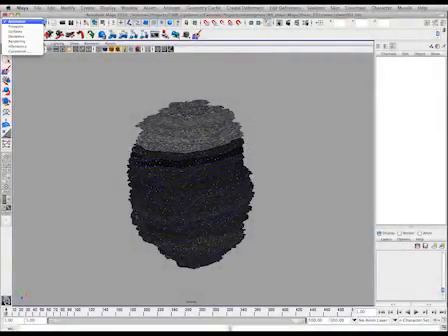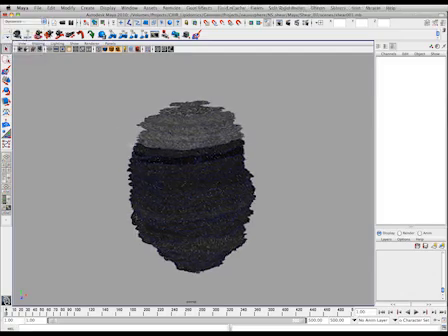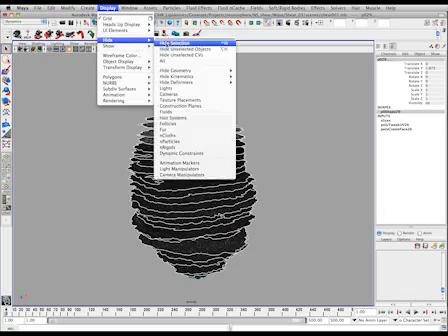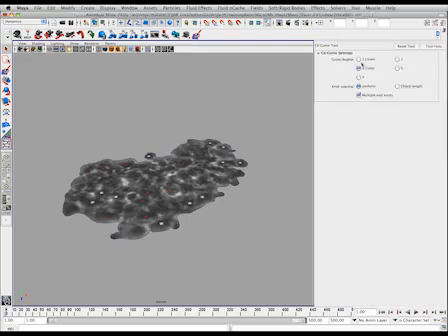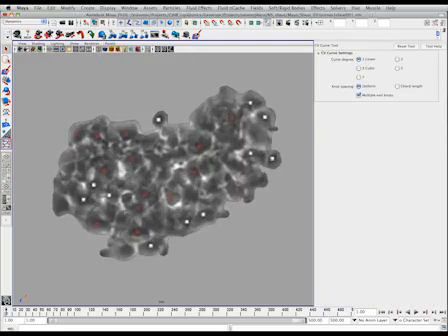From the status line of Maya's user interface, change the menu bar from its default animation setting to Dynamics. Leaving only the first section of the neurosphere visible, hide all other sections by changing the display settings from the Display tab of the main menu. With the CV Curve Tools options box open, select one linear from the CV curve settings. Viewing the scene from the top view camera, begin assigning points to the cell maps, creating one curve for the CX29 negative cells and the CX29 positive cells.